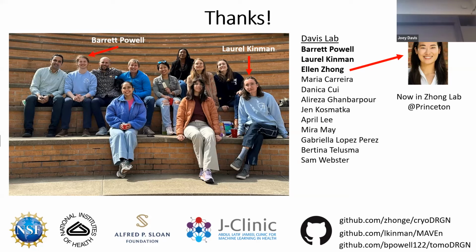And then the second is that the throughput of tomography currently is quite low, which means that you don't get that many tilt series. So even for CryoDRGN or TomoDRGN, you still are averaging across particles in the same sense. And so that means that you need relatively abundant complexes to get up to the numbers that you need if you have 100 tilt series or something. So that's starting to change.